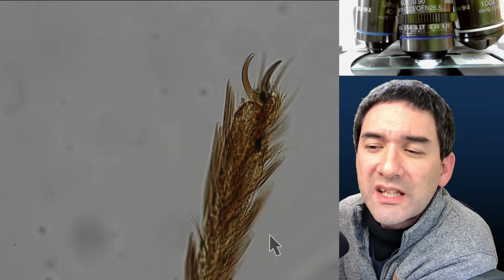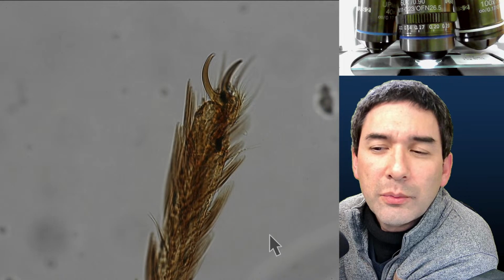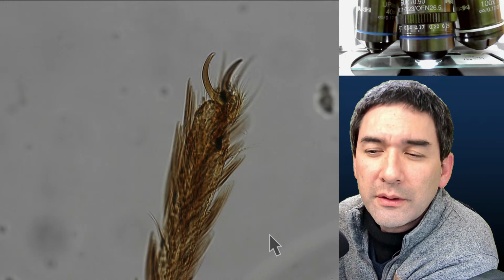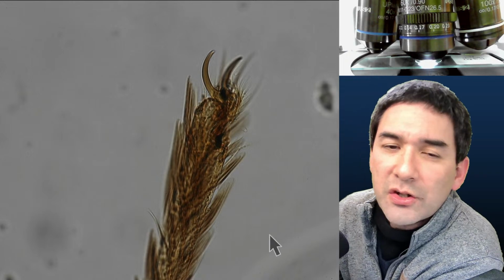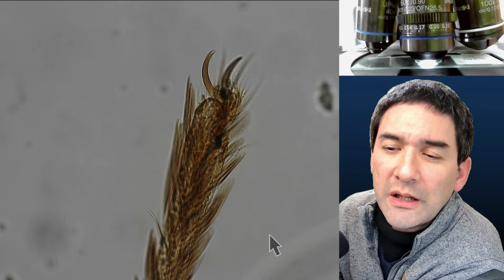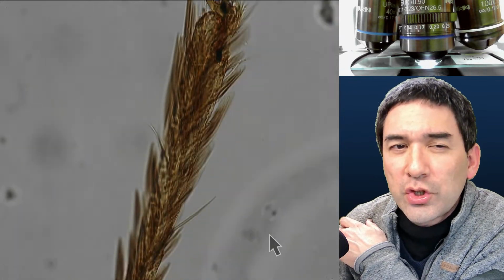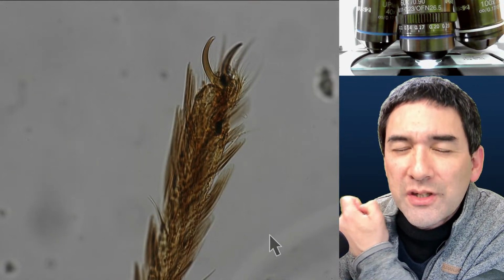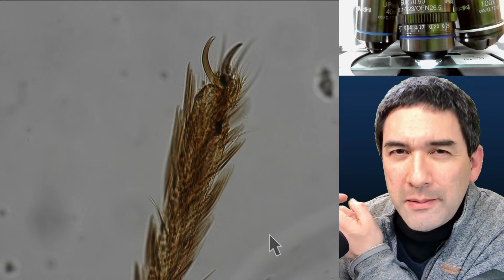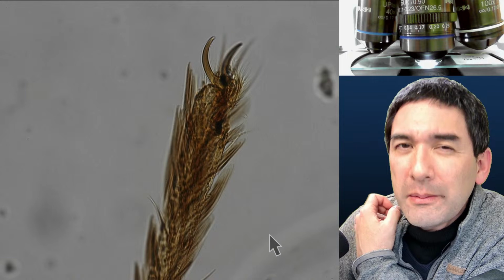Would you focus on the spike of the leg, the one just below the last leg? Which one? An insecticide, I see. I don't know if the diatomaceous earth, which is a very fine powder, actually damages the exoskeleton, but maybe it's taken in or inhaled by the insect, and maybe this kills it.